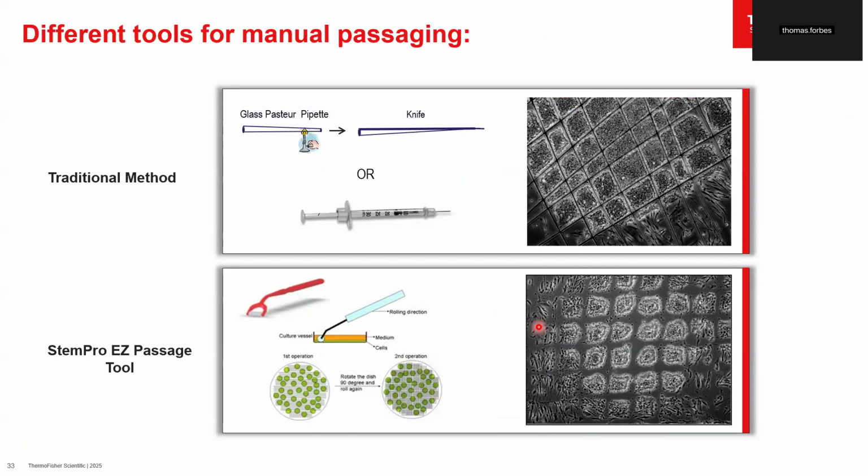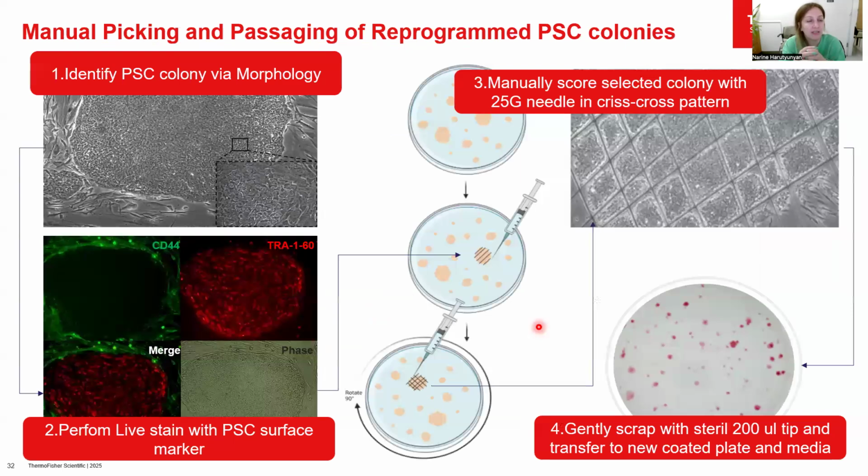So there was one question, hand raised from Noreen. Yes, hi. Sorry, go ahead. Yeah, it's okay. So in terms of the colonies, when they're reprogrammed, sometimes they're close to each other and they merge, right? So when separating and scraping and making that colony number one, how much of an issue might that be towards the end, that it's two different reprogrammed cells that actually form that one colony?